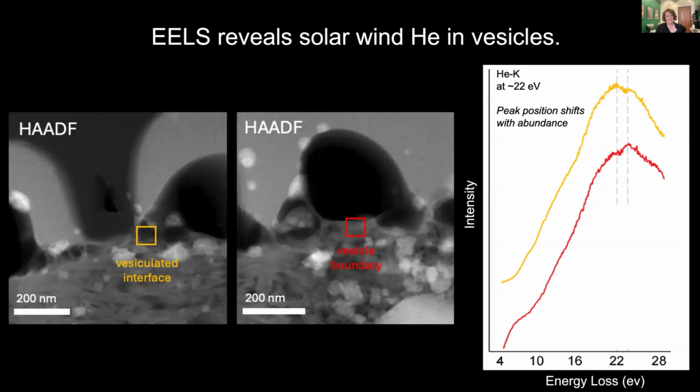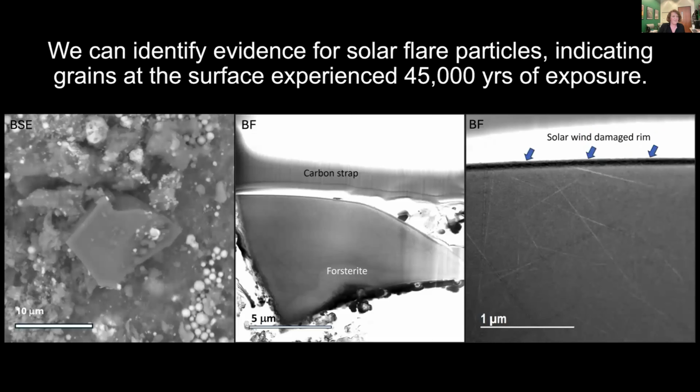So in order to do that, we performed electron energy loss spectroscopy, or EELS, in the TEM. And in the low loss energy regime, we can actually analyze the samples for helium directly. It's got a peak on the plasmon at about 22 eV. And when we perform these EELS analyses of those vesicles at the interface between the melt and the underlying material, we see evidence for helium derived from the solar wind, telling us that even before this micrometeorite impact deposited this melt on the surface, this grain was exposed to solar wind irradiation on the surface of Bennu. And this was the first detection of solar wind species in the samples from the asteroid.